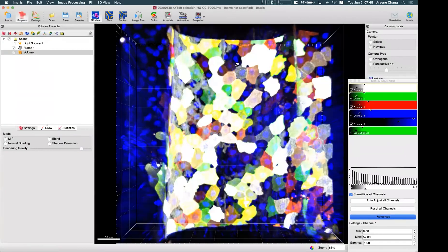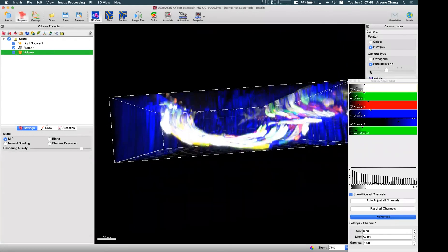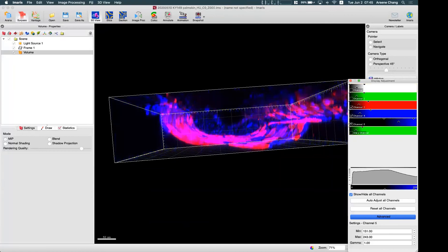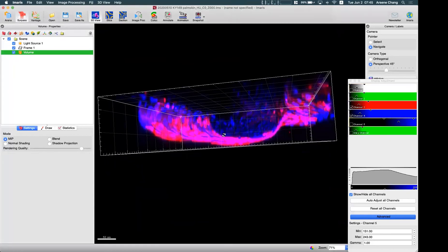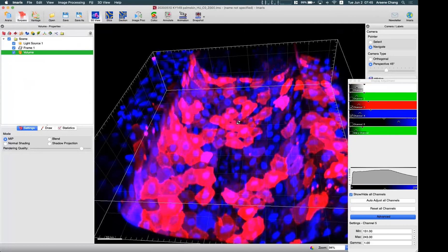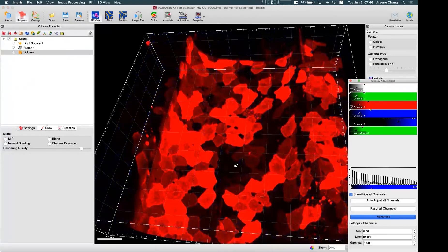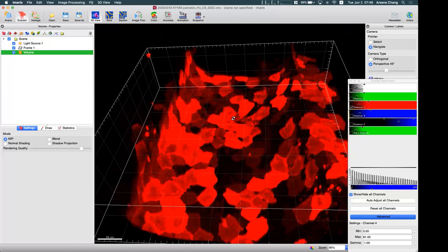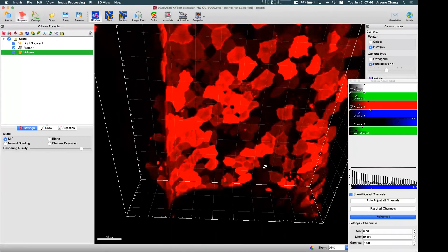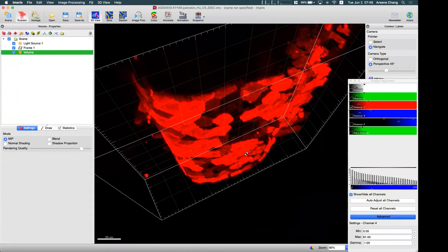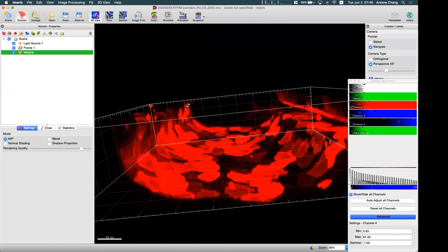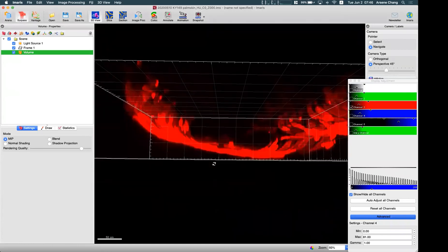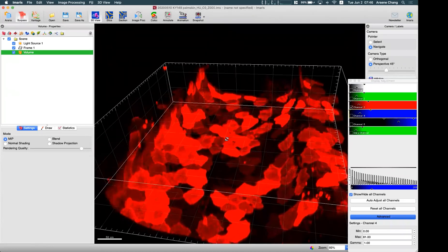Let me see if I can get some examples. For example, like this. If I can turn off some of the channels, for example, if there are some nucleus and some cells staining like this, and instead of 2D image this is 3D.